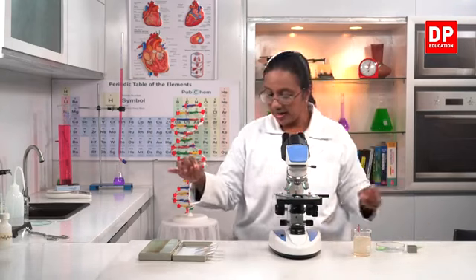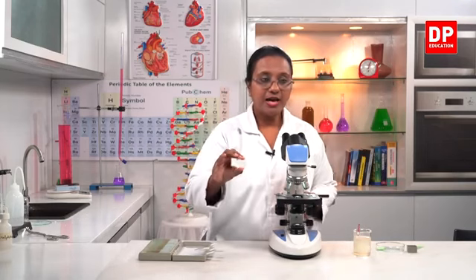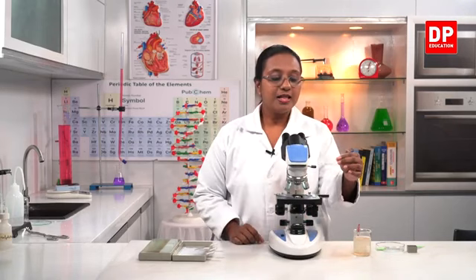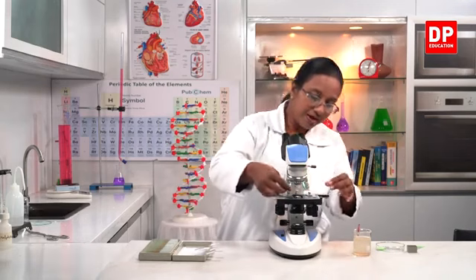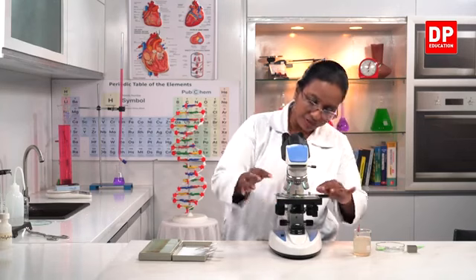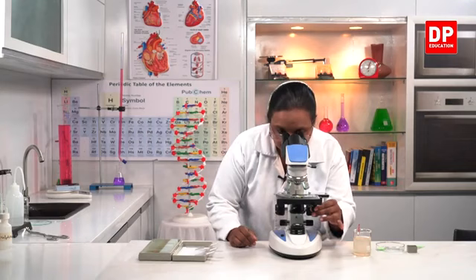Then here I have some permanent slides. Here again you can see I have the paramecium here. You can see the slide. That is a permanent slide of paramecium. So if I observe that under the light microscope, again to make sure that the sample is in position.